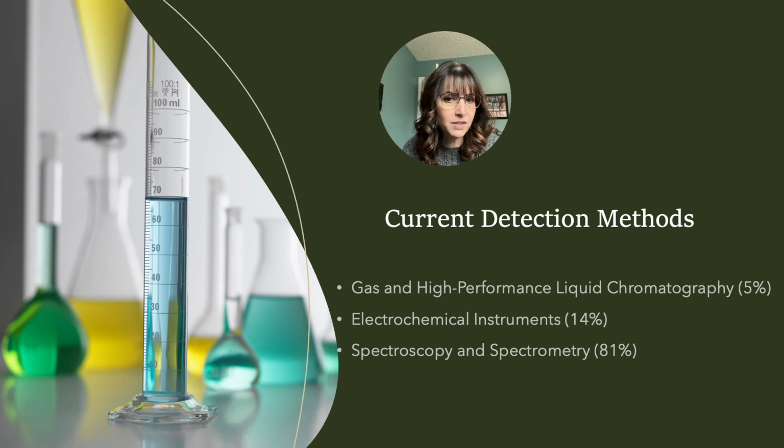Now, there's lots of different techniques here. A few include atomic fluorescent spectrometry, atomic absorption spectrometry, several different kinds of inductively coupled plasma emission spectrometry, spectrophotometry. They also use cold vapor atomic absorption and cold vapor atomic fluorescent spectrometry. The type chosen really honestly depends upon the sample and its matrix. Is the sample aqueous, solid, gas? What matrix is it in?